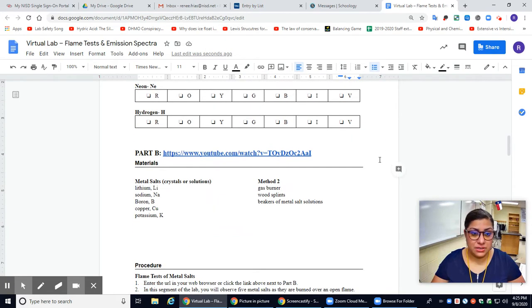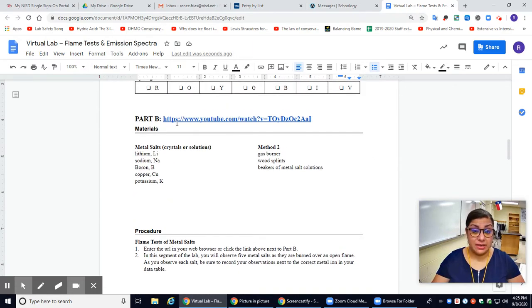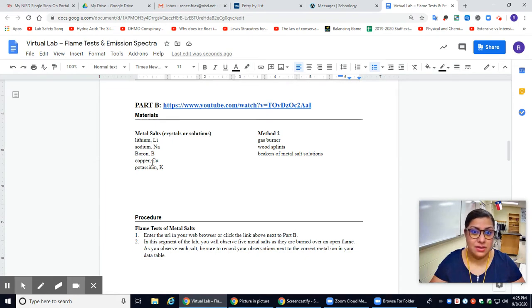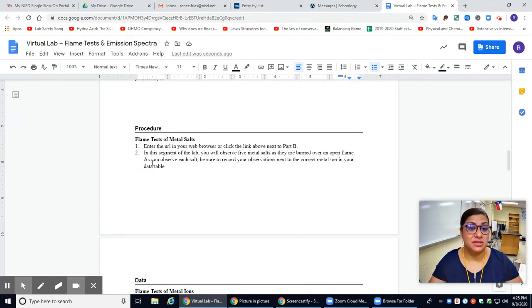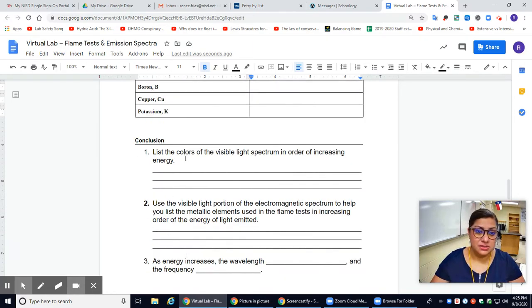That's part 1. Part 2, here's the video for part B, the second part. We have 5 metal salts, and those are going to be put on fire, and each salt is going to emit a different color flame. So this one, you're just going to type whatever color you saw. All right, and then we have questions.